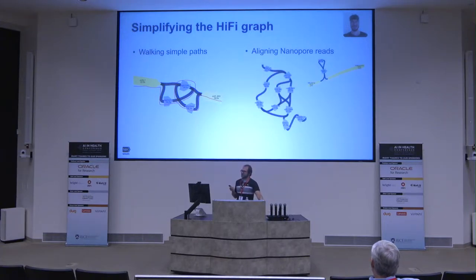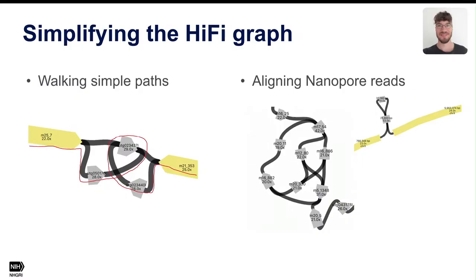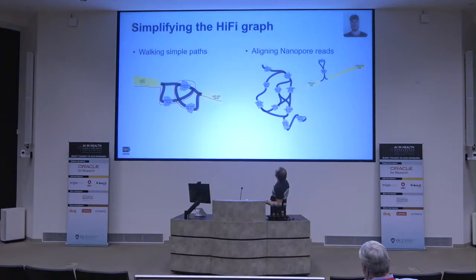There are examples where the ONT data is necessary and there's no information in the HiFi data, and they can be complex like the one here where there's this branching structure. So we don't know which way we need to go, right? This node needs to be used twice. You can see from the coverage because it's double everything else. But we don't know if we need to go this way first or this way first, right? And there's no information in the HiFi graph that will let you figure it out. The traversals are equally likely from all the data you've seen.